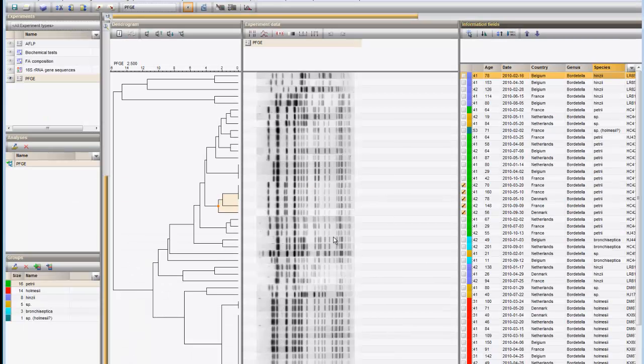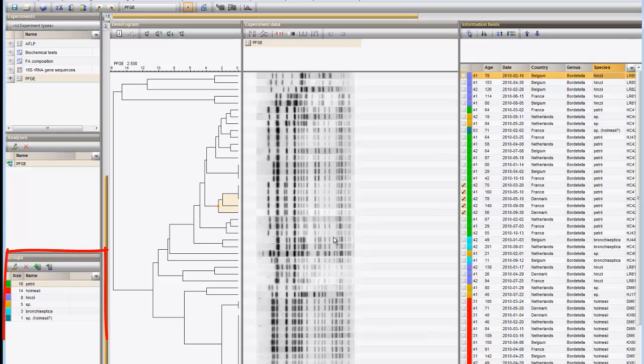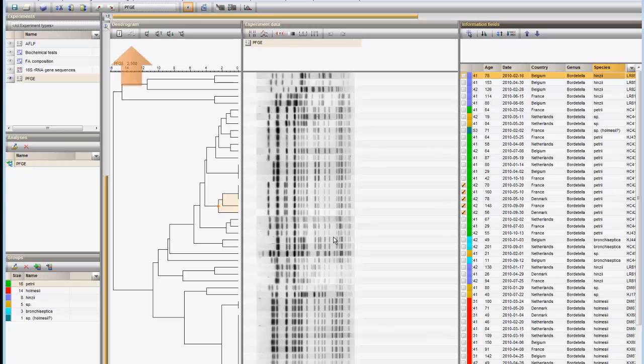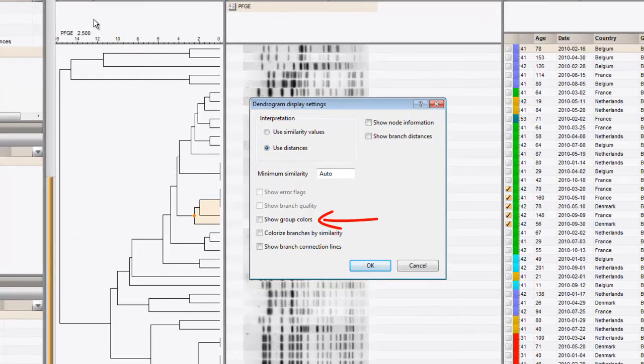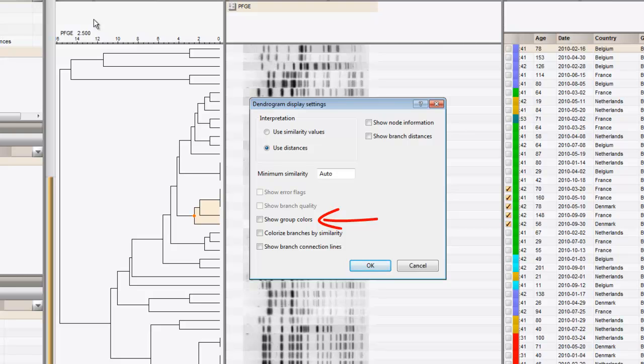Six groups are now defined, which automatically got the names of the field content that was used. Note that the group colors can also be shown on the tree using the display options. To display the group colors, I check the option Show group colors and press OK.